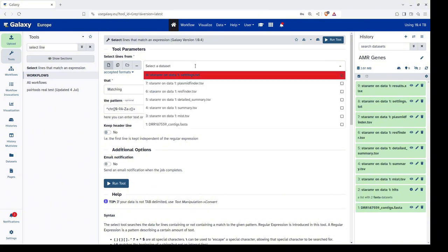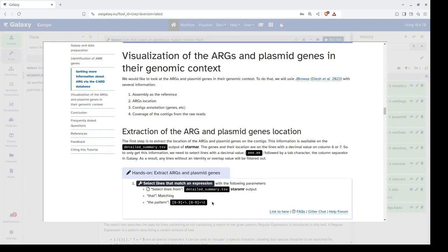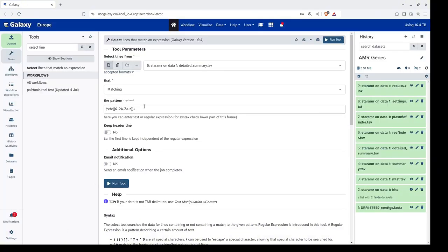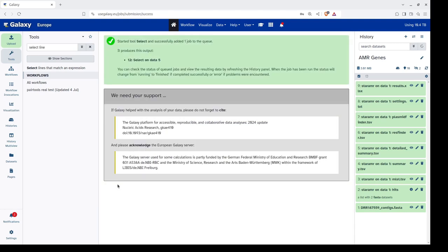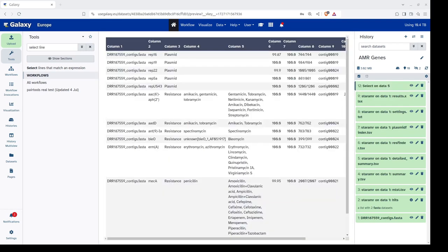We have selected the tool and now we will feed the detailed_summary.tsv file as input and specify the pattern to obtain the desired information. All parameters are specified and we click the Run Tool button. Now we have obtained the results from our pattern matching tool, which we can view by clicking the display eye button.